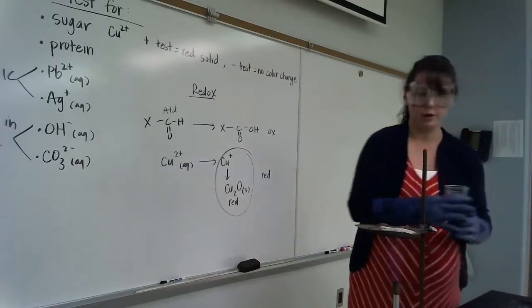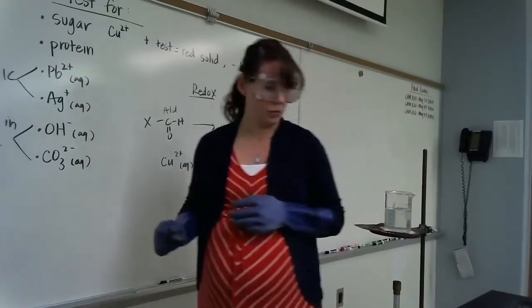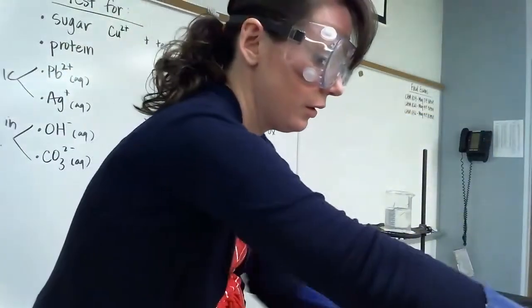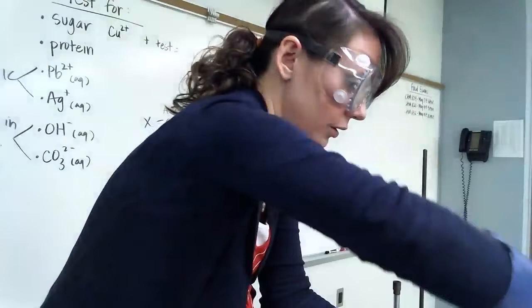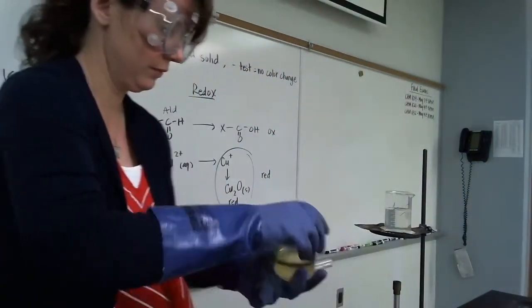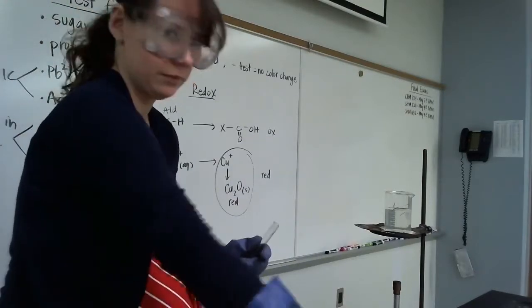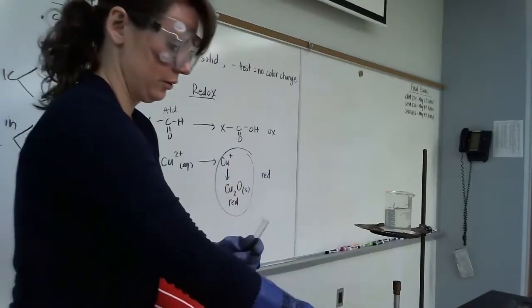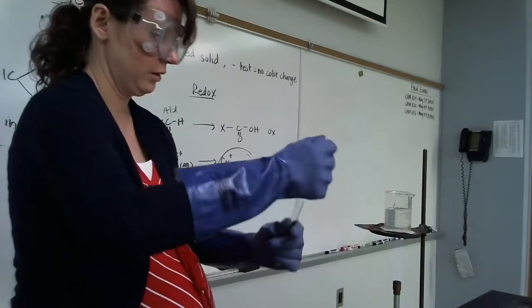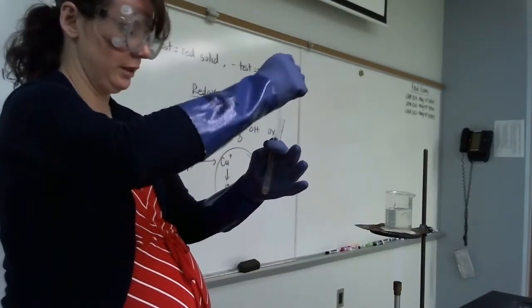We're going to use a water bath. We don't want to heat this directly. We're just going to use a water bath. I'm going to take a sample of my lake water. Okay, so here's my lake water going in. You don't need a ton of it.